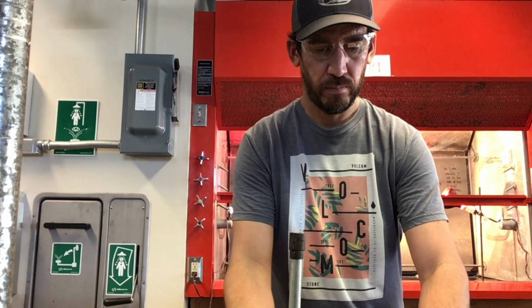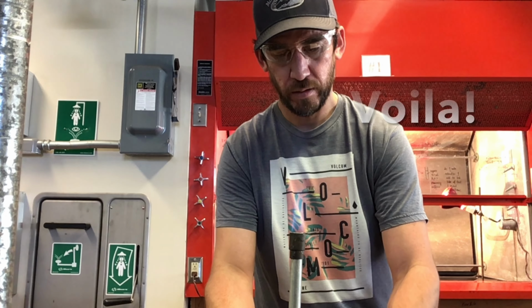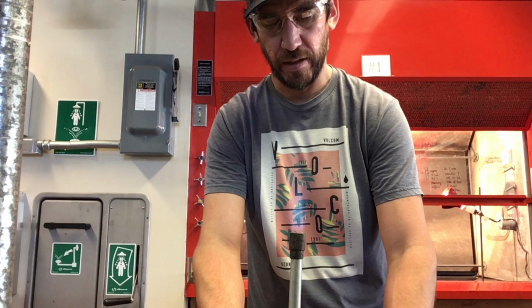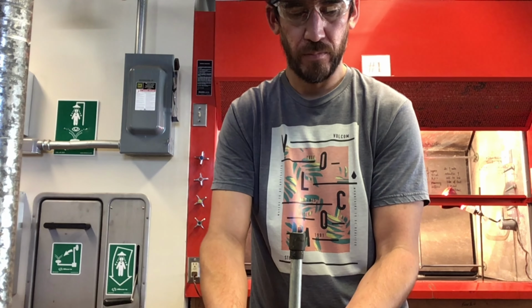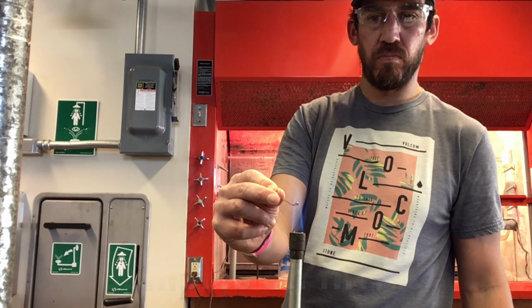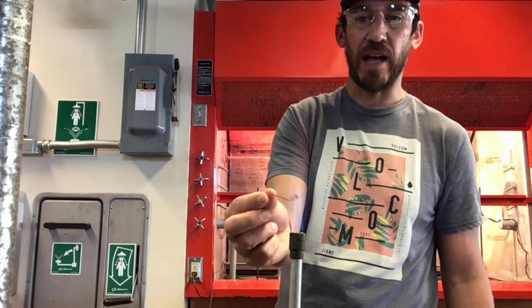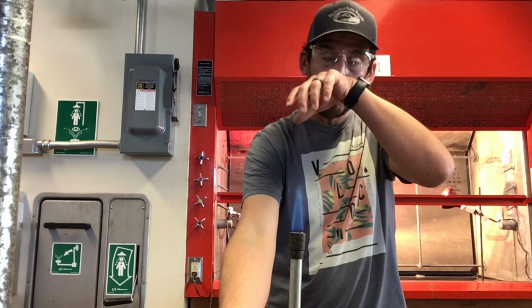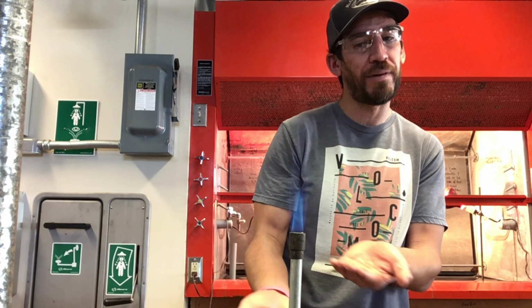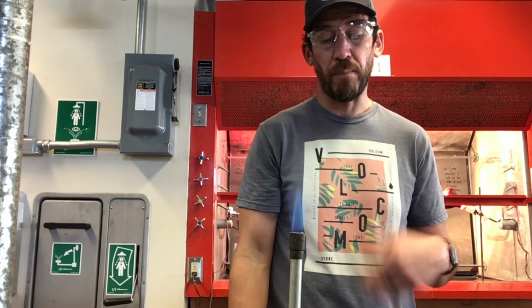Roll it. Boom. Big chunk. What I did is I rolled this one up real nice so I could actually fit something, just kind of set it right on there. Boom. Ooh, so it was a flash of green. Really good. A flash of green could be that this particular compound had halogen in it. However, since it was just real fast, it could have been a little bit of residual from before.